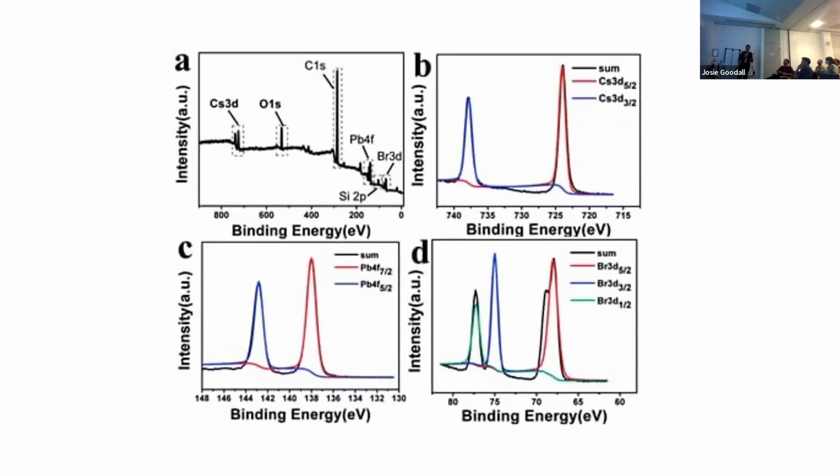You only ever get two, because you're only removing one electron from the filled orbital. There's only two ways that the spin of that hole can be. So there's not three ways to go. So unfortunately, that is incorrect. But there's another thing related to that.